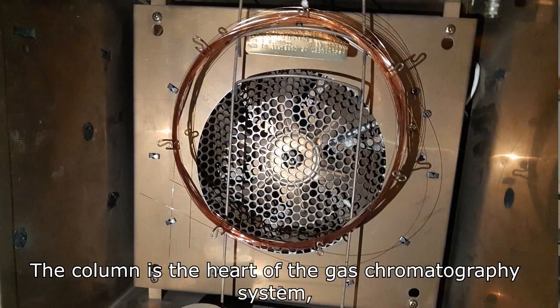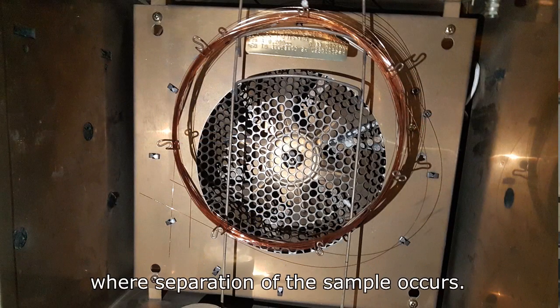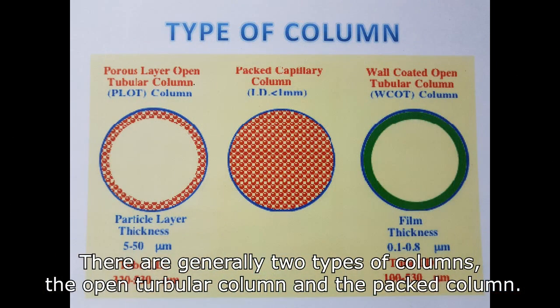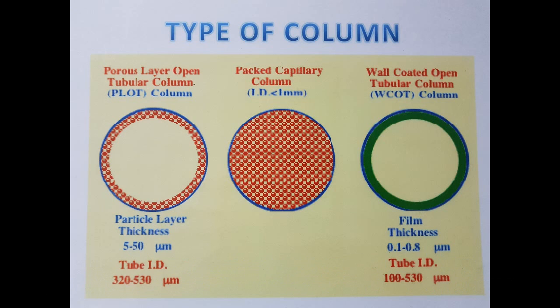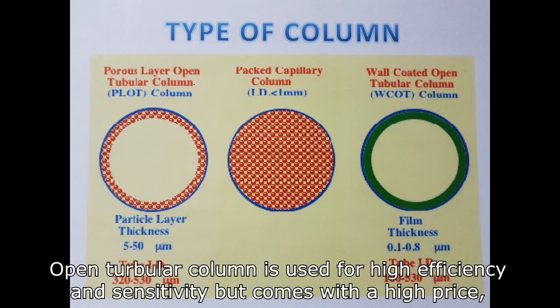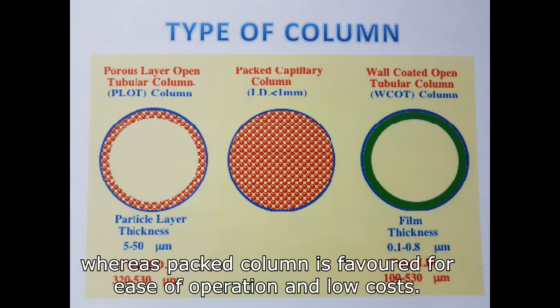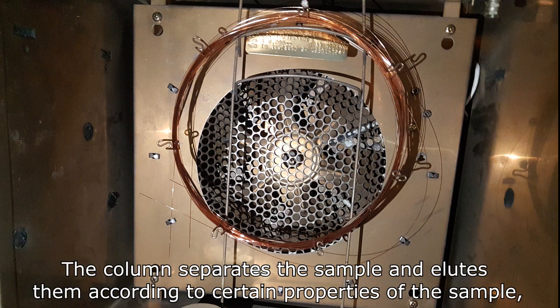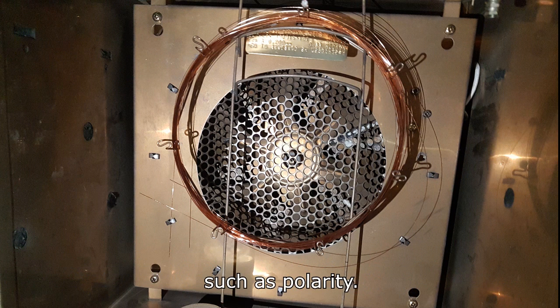The column is the heart of the gas chromatography system, where the separation of the sample occurs. There are generally two types of column, the open tubular column and the packed column. Open tubular column is used for high efficiency and sensitivity, but comes with a high price, whereas packed column is favored for ease of operation and low cost. The column separates the sample and elutes them according to certain properties of the sample, such as polarity.